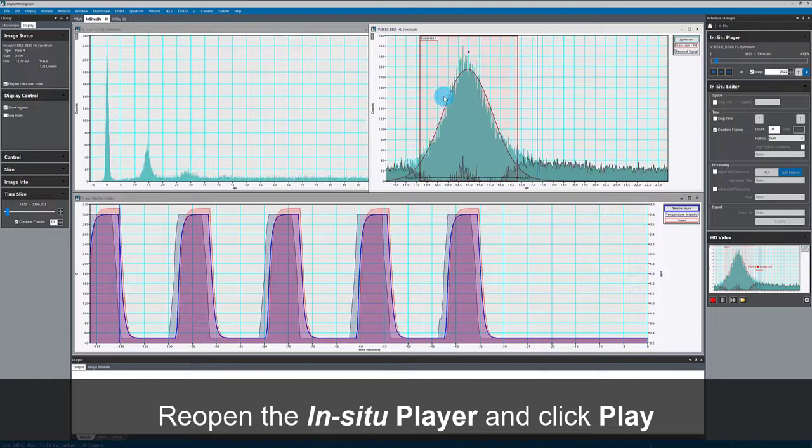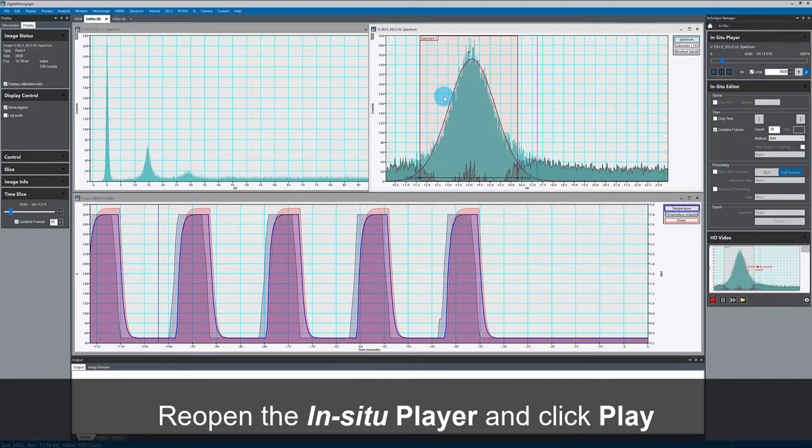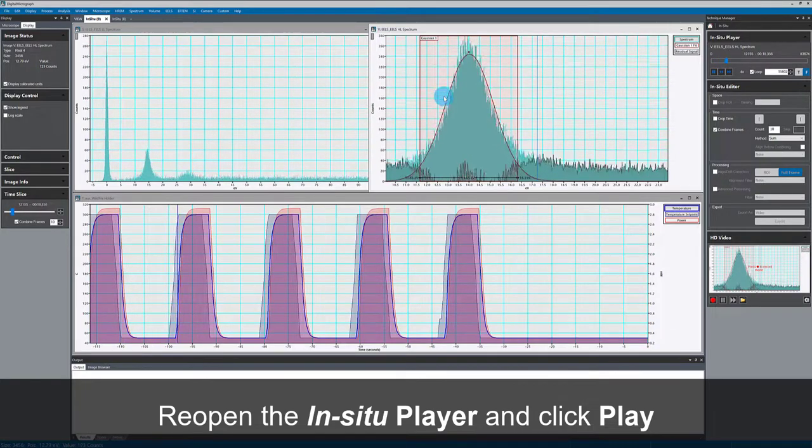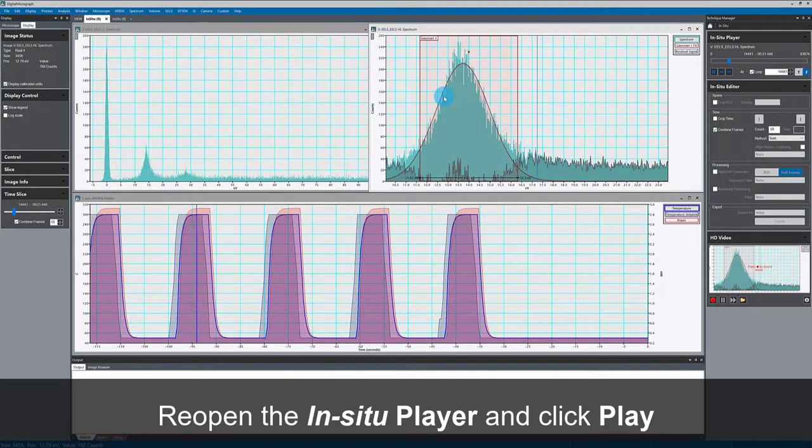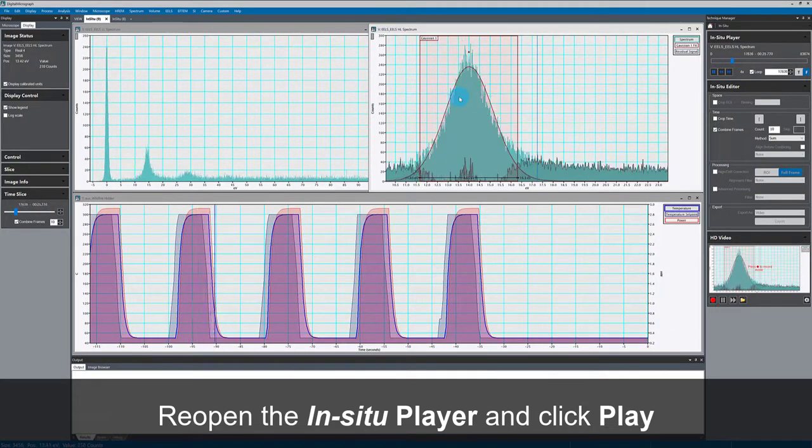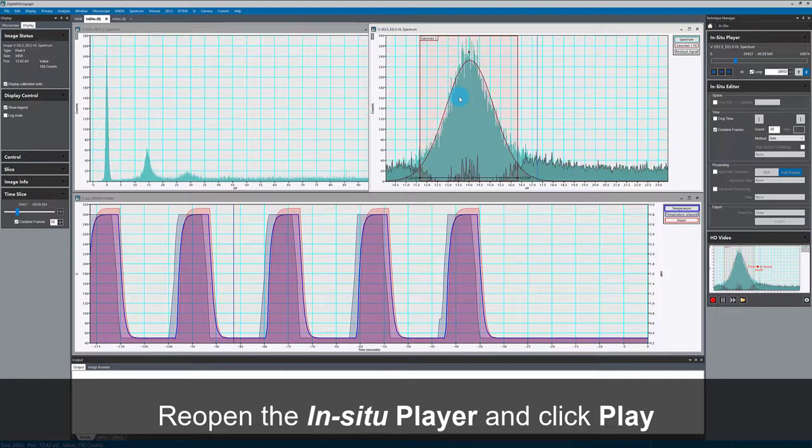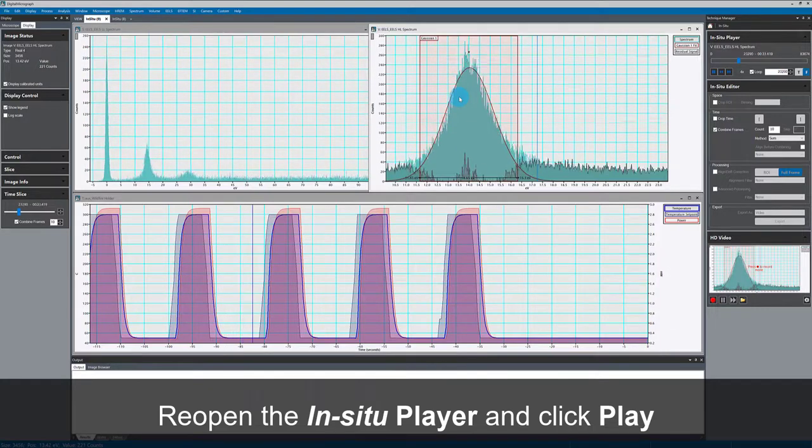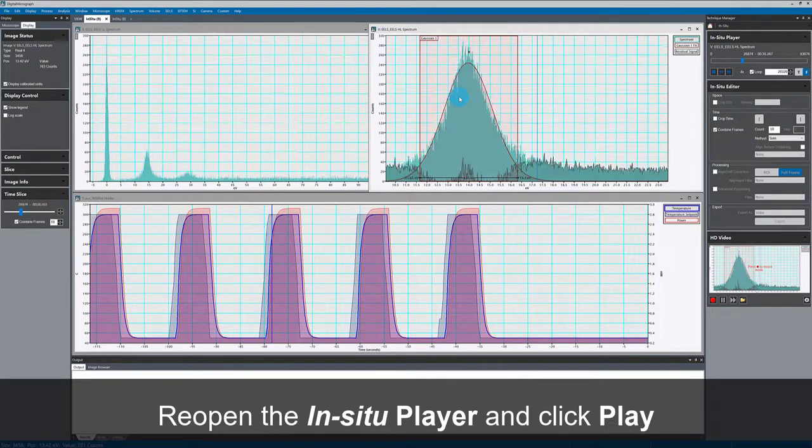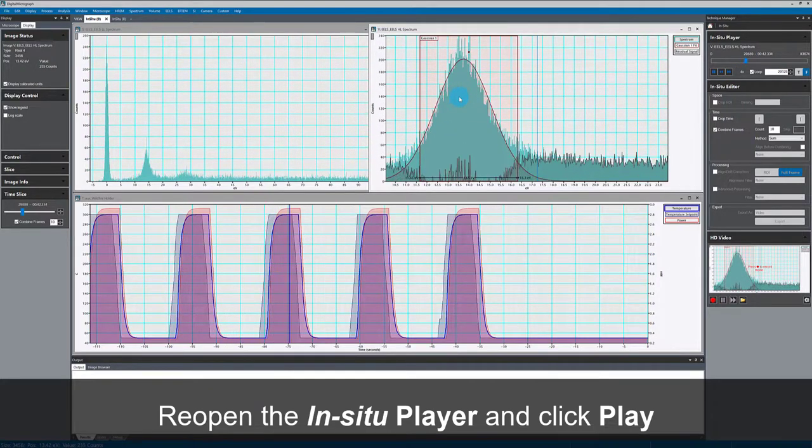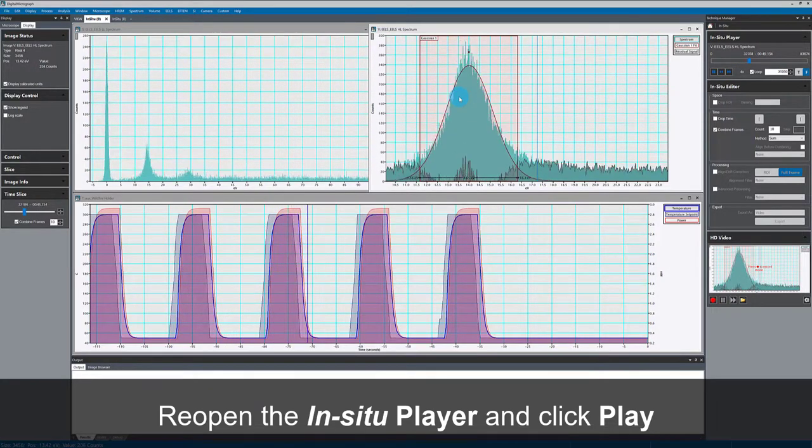And this shift is caused by the expansion of the material during melting. Since you have lower electron density, the plasmon energy decreases.